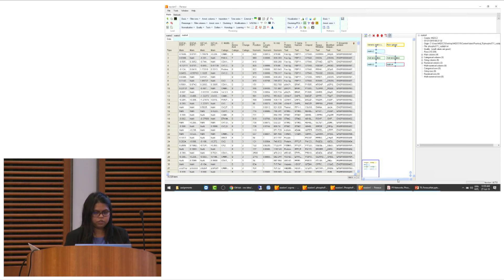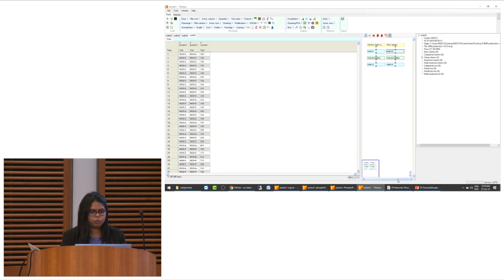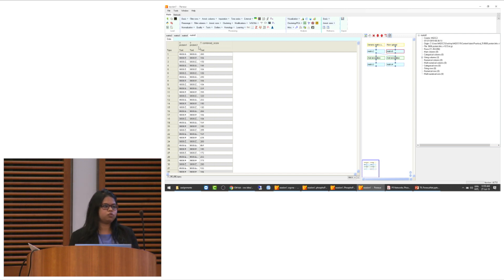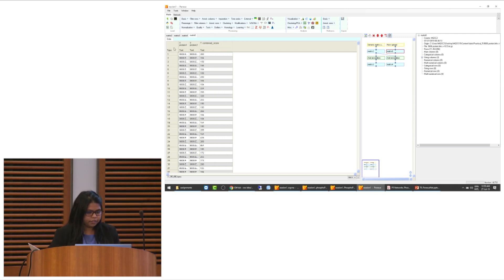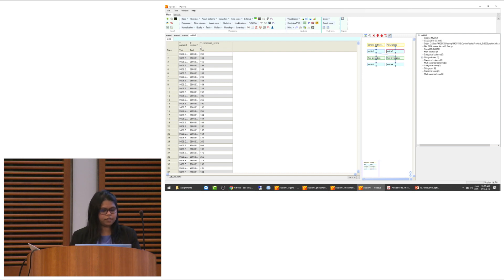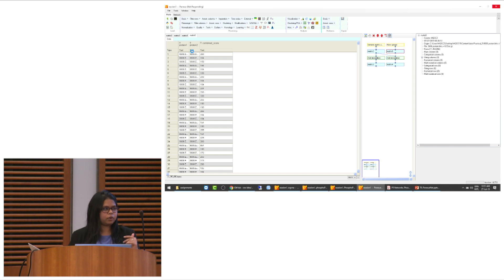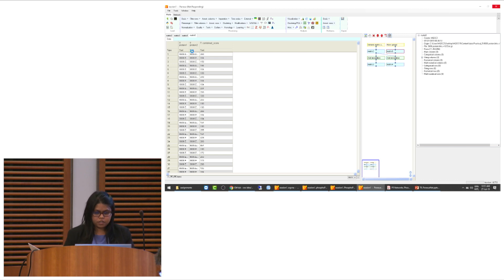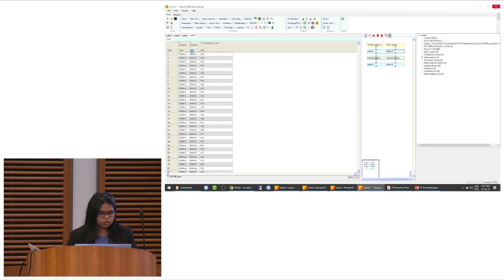We know there are very popular network databases available, like STRING and PSP for kinase-substrate relationships, and BioGrid. These databases are available as tab-separated files and you can use them for your analysis. In this tutorial, we will use the STRING database. We have already downloaded the STRING database here for Homo sapiens — let's take this one.